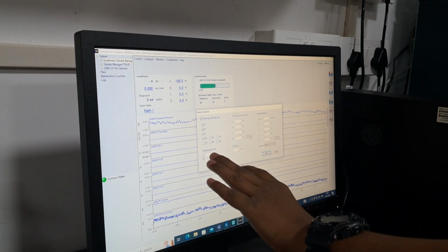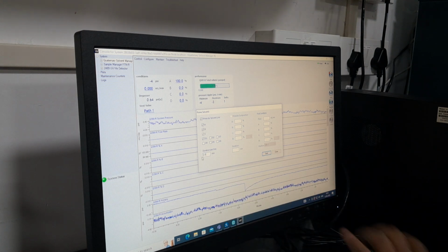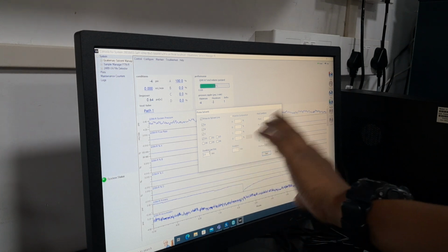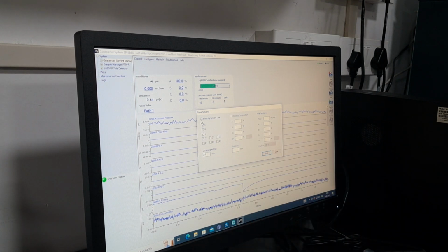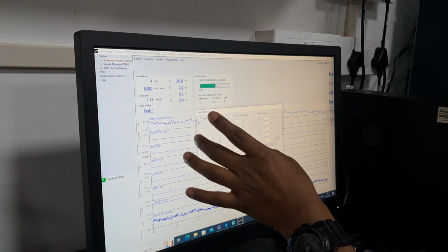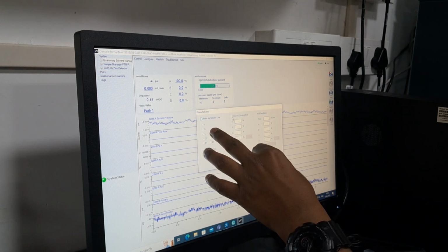All the individual channels will be going 100%. It will take a time of 2 or 3 minutes per line. It is showing us the duration per line actually. So individually, he is asking a question about the prime by composition. If you select here, just a second. Maybe here it is not selecting.